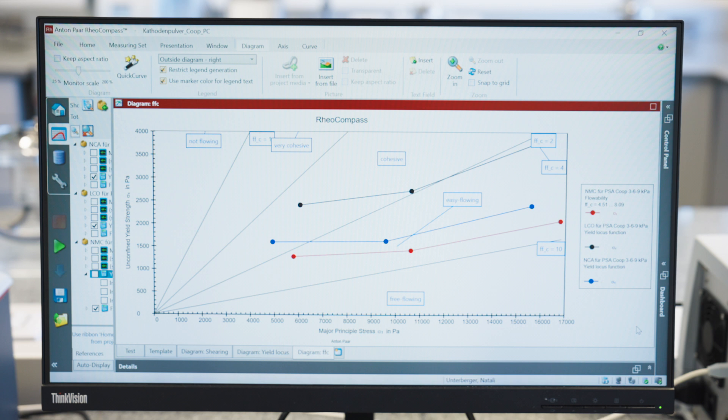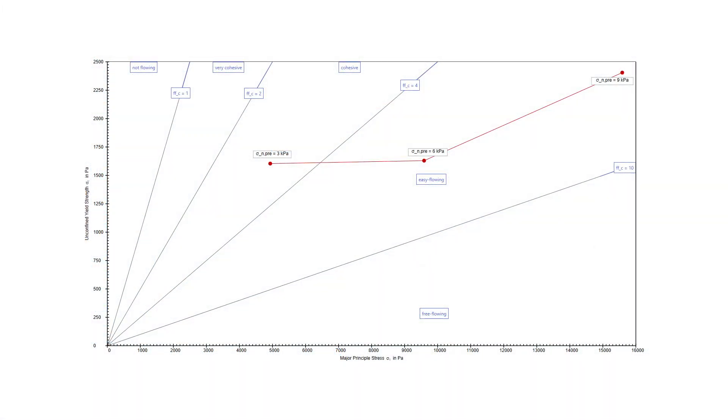At the end, for each consolidated stage, the software will plot the flow function coefficient in a diagram, which will classify the powder flow anywhere between non-flowing and free-flowing based on its position in this graph. So we saw how powder flowability varies greatly under different conditions. This is why it is important to investigate a powder's flow with more than one value, and at various stages of storage and processing during battery manufacturing.